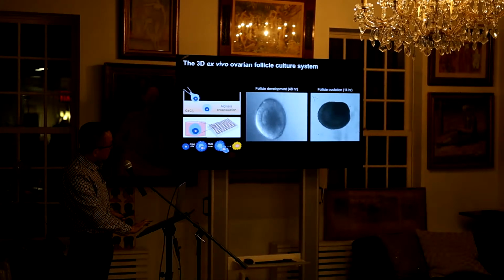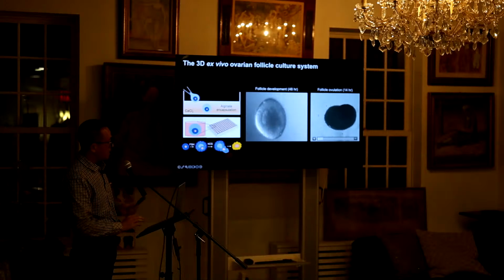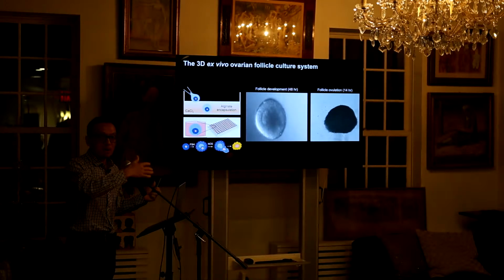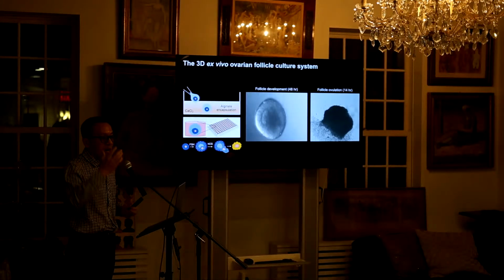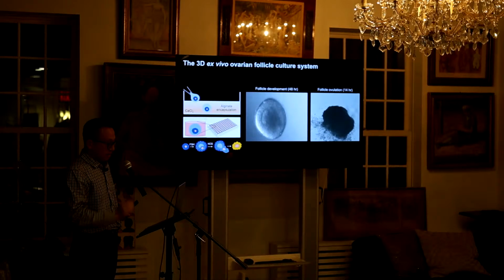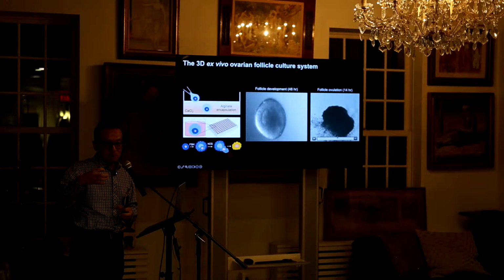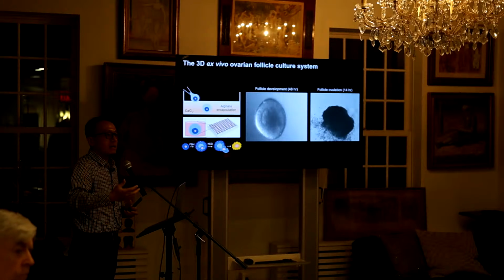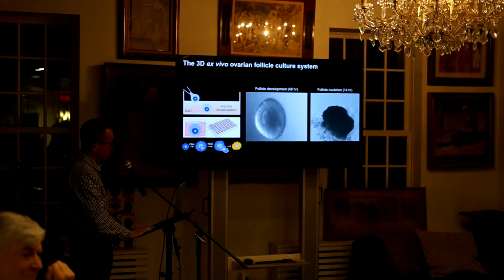And then after 8 days of culture, for the antral follicle or the fully mature follicle, we give them hCG, and you see what happens during the 14 hours. Because it's a mouse follicle, the ovulation time is about 14 hours. It's very interesting that only one side of the follicle is rupturing, and they try to push the egg out. And then if you add hyaluronidase and get the single oocyte, you see the oocyte with polar body extrusion is a pretty nice oocyte, comparable to if you do superovulation and get the oocyte from mice.